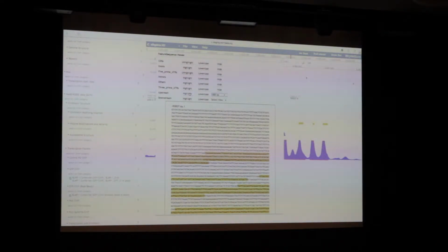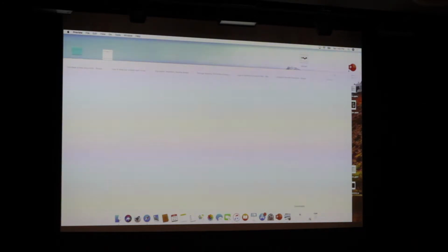100 base pairs upstream, and lowercase that. And so now if I grab that sequence, copy it and paste it, it will maintain the highlighting, it will maintain the upper and lower casing. It's really, really nice. I can lowercase the UTRs, that's another pretty common thing to do, or the introns, that's a pretty common thing to do too. I know that I am running really low on time.